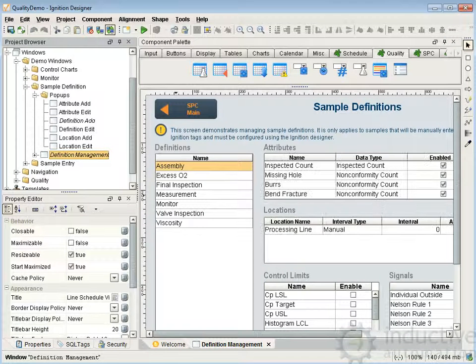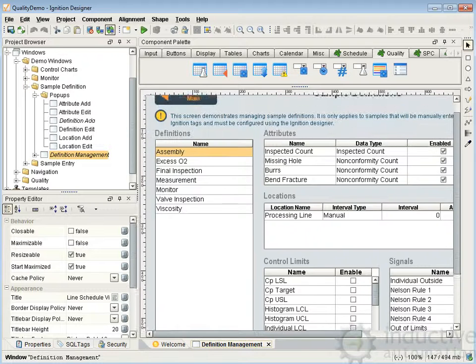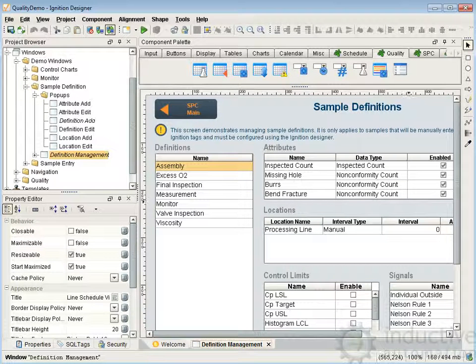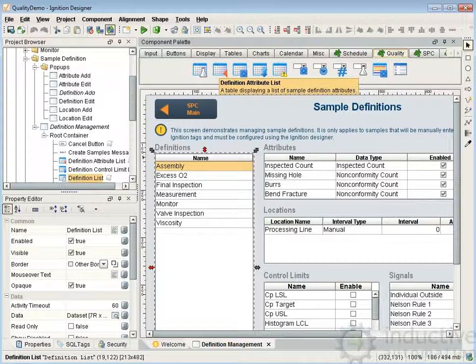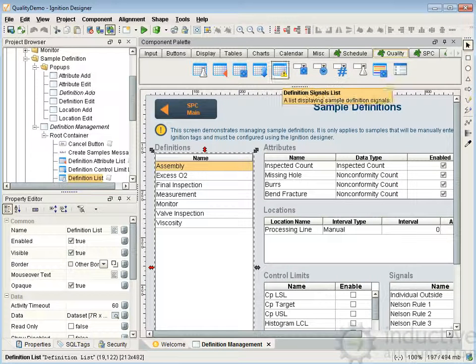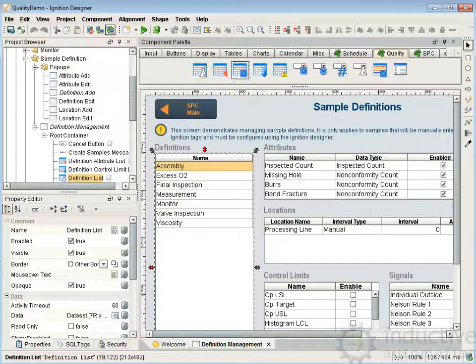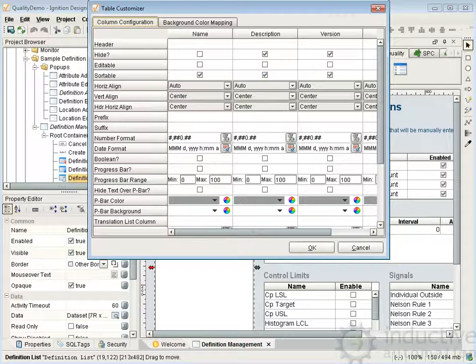I open up the definition management screen. Because of the recording resolution we're going to have to scroll around. This screen is actually very straightforward — this component here, if we go up on the quality tab, is this component and you just drop it down on the screen. The attribute works the same way, same with location, and then we have the control limits and signals. Each of these components are table-based components — you can come into the table customizer and select what columns you want to show and change other items about that.